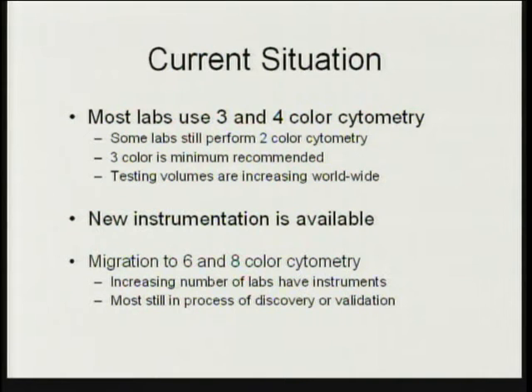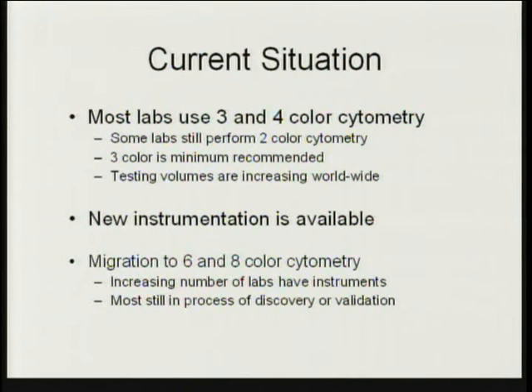It's providing useful information to people, but there's still a lot of heterogeneity in terms of the way people are going about doing this. At the same time, new instrumentation is becoming available. And one of the things that our laboratory is known for is we were one of the first, or the first laboratory in the world to put online a higher level of multicolor flow cytometry, where our standard now is to do 10-color flow cytometry routinely on clinical material. And we've done this for a number of years now. Other laboratories are starting to migrate now to doing 6 and 8-color flow cytometry as newer instrumentation becomes available.